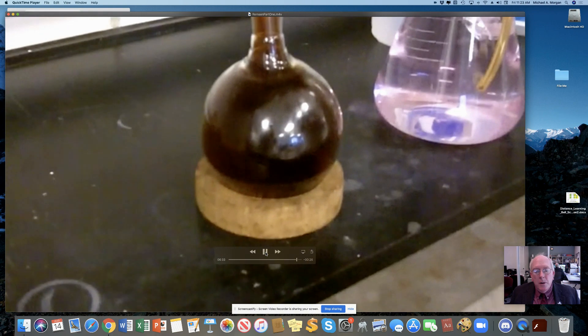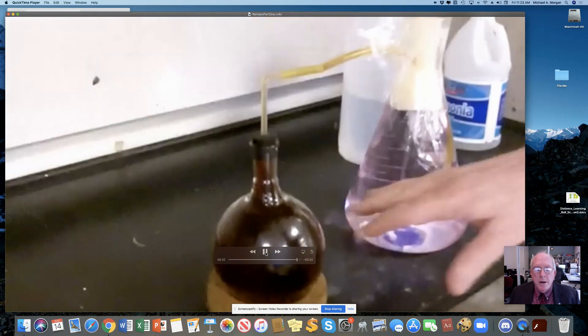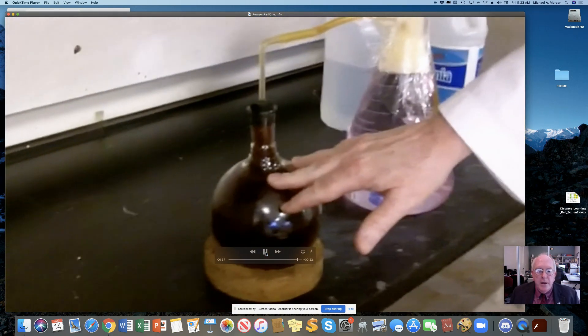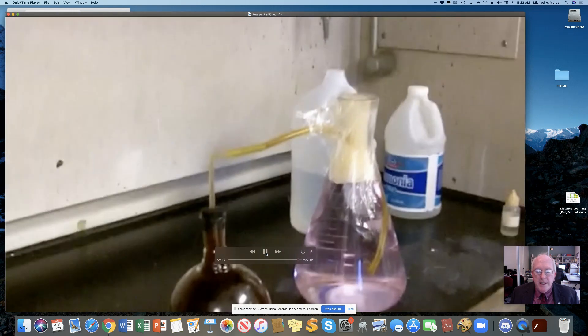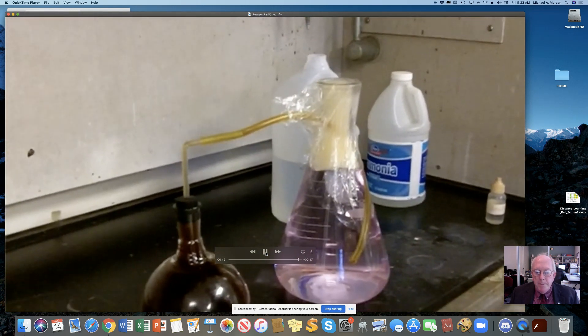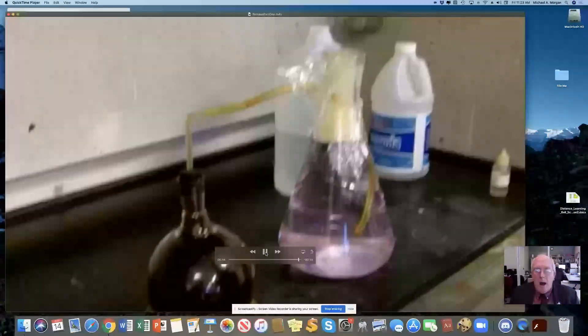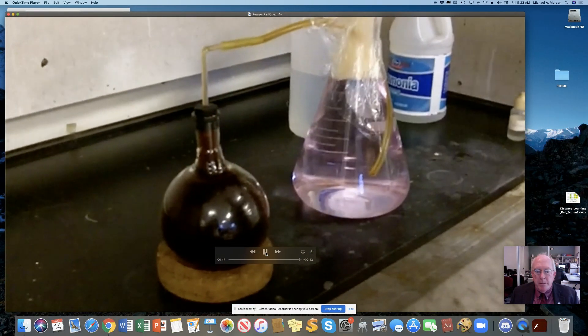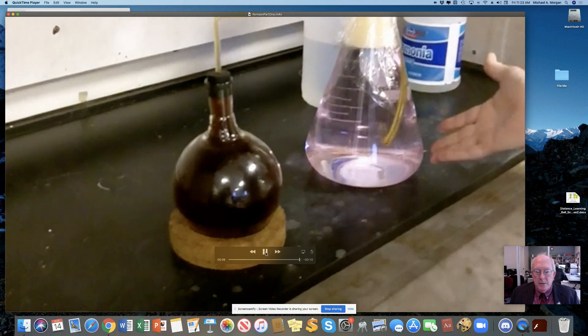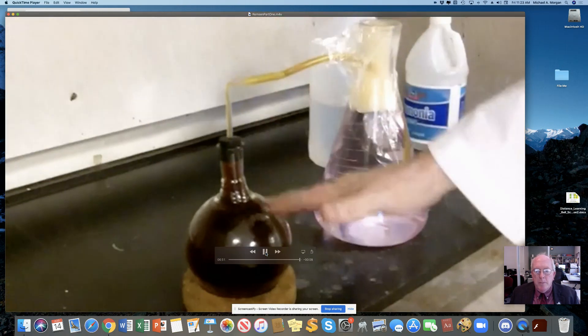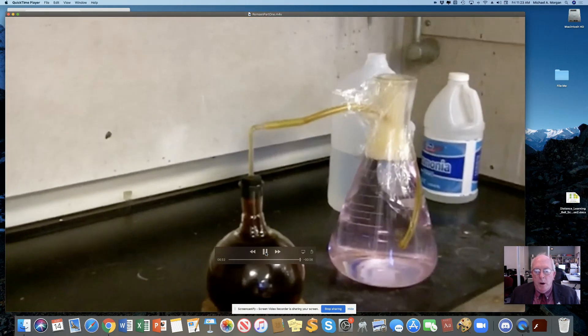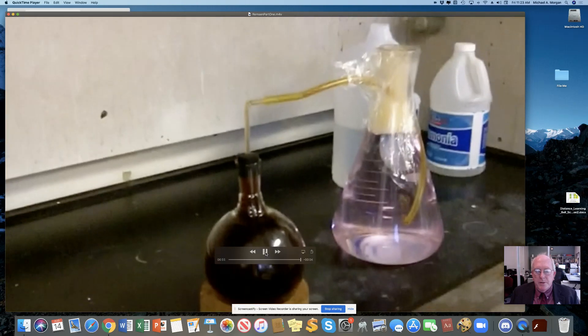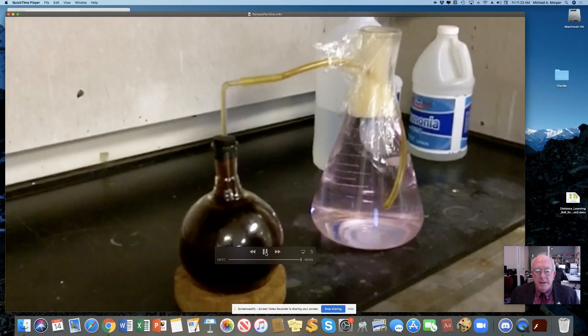So, this is run for a while. Big brown cloud in that round bottom flask. It's bubbling over to the other side. Now, at this point, I typically have everybody take out a piece of paper, draw a picture of what this looks like, and you'll be able to go back and re-watch this video and pause it so that you can draw a better picture.